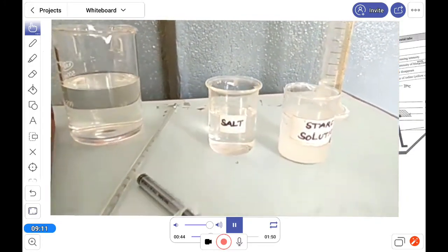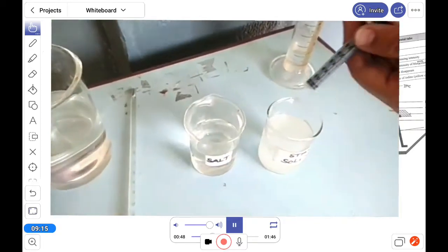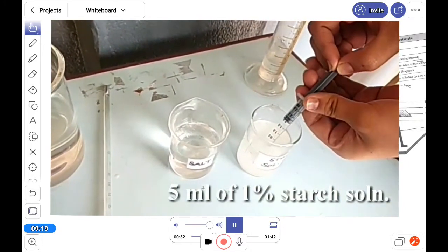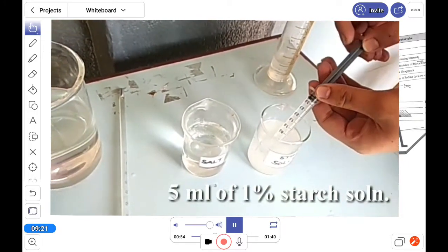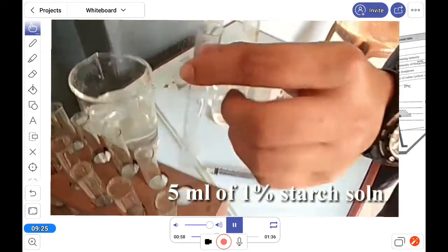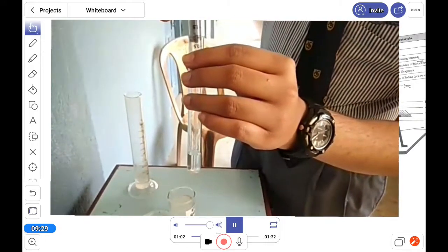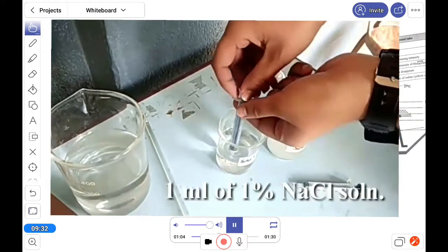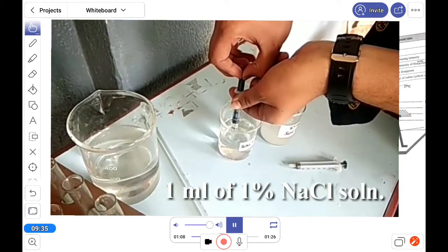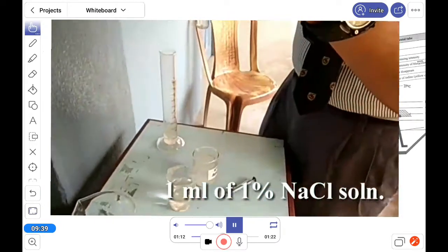Here are the 1% starch and 1% salt solutions. First we take 5 ml of 1% starch solution in a test tube. Here it is. This is the 5 ml taken. Then after that the 1% sodium chloride solution is added in that same tube.